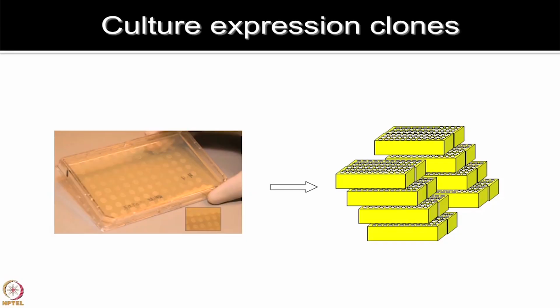So, for the next couple of slides I will walk you through very fast, just keep looking at the images. These are just some illustrations. I am sure you have already done DNA purification work yourself, but in this case we are showing you how it is done in a more high throughput manner, in 96 well plate format or 384 well plate format, because you are talking about 10,000 to 20,000 genes of interest to be printed on the chip. So, you cannot do it in tubes. The whole setup is essentially meant for high throughput biomolecular sample preparation.